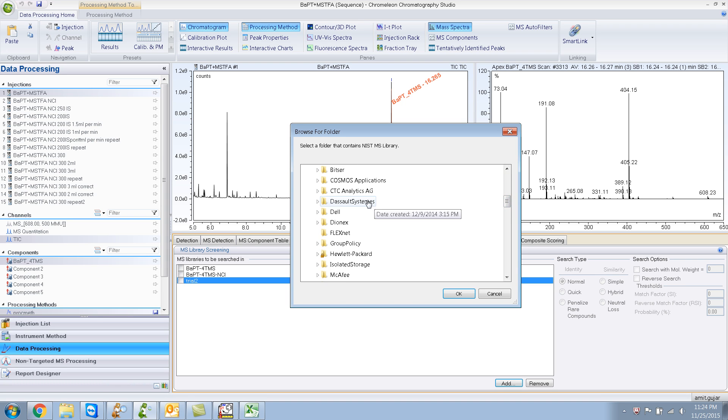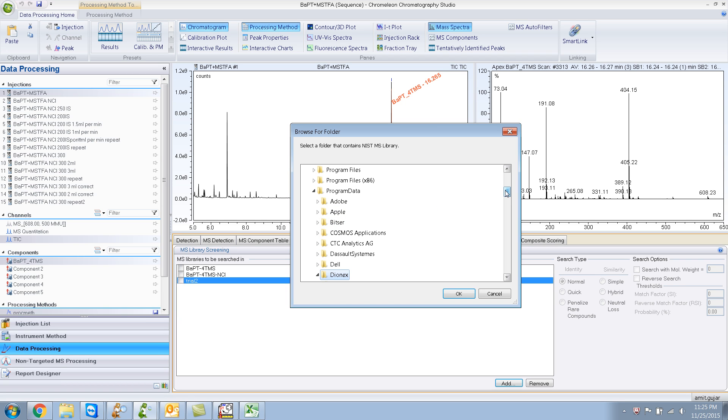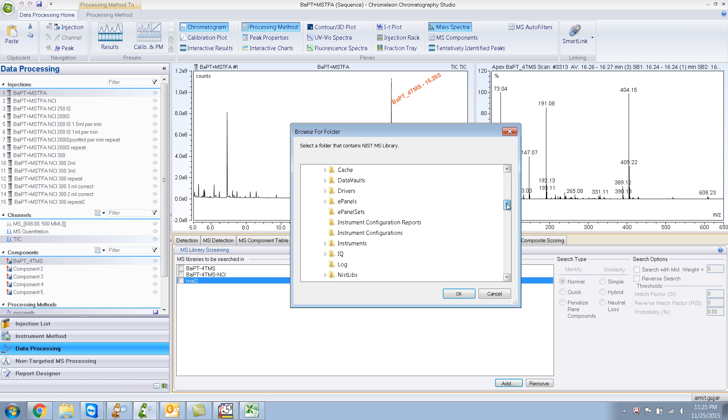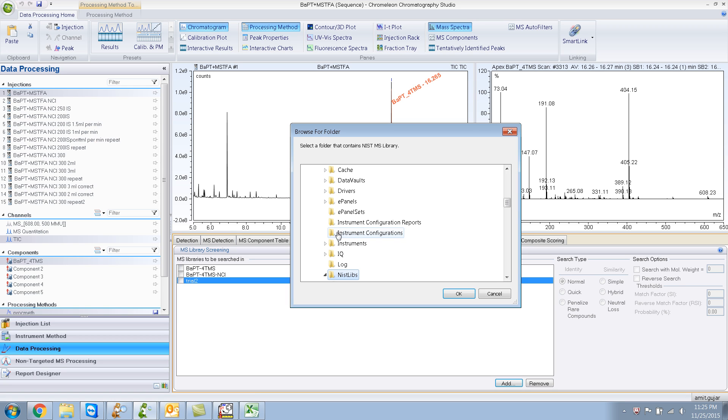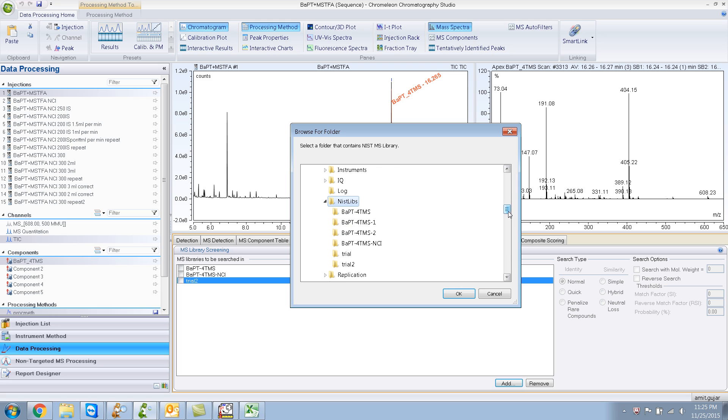And Dionics. And NIST LIBES over here. And there you have it. This is the library we just created.